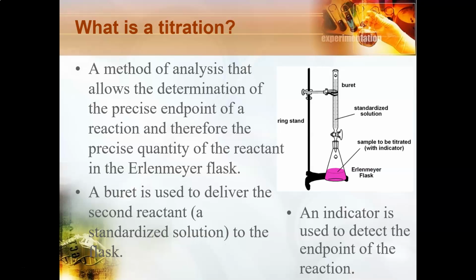So the buret is used to deliver one of the reactants. So we have one of the reactants in the Erlenmeyer flask, and then the second reactant is delivered using the buret. So the standardized solution will go in the buret, and the unknown solution goes in the flask.